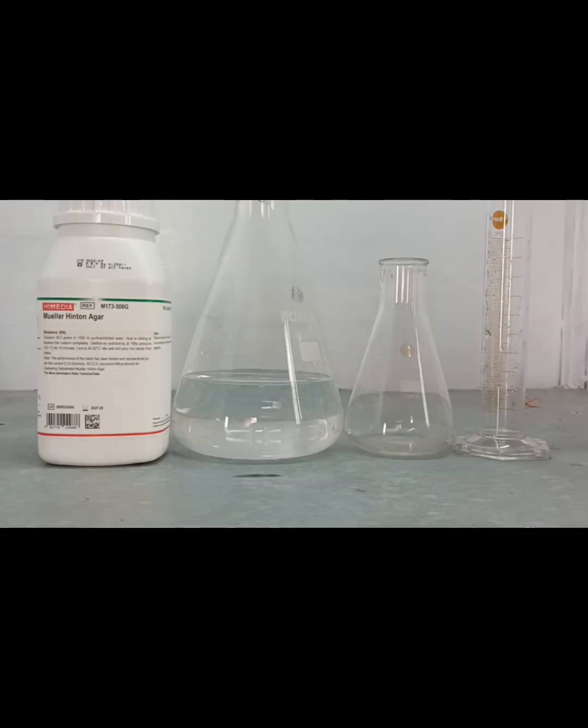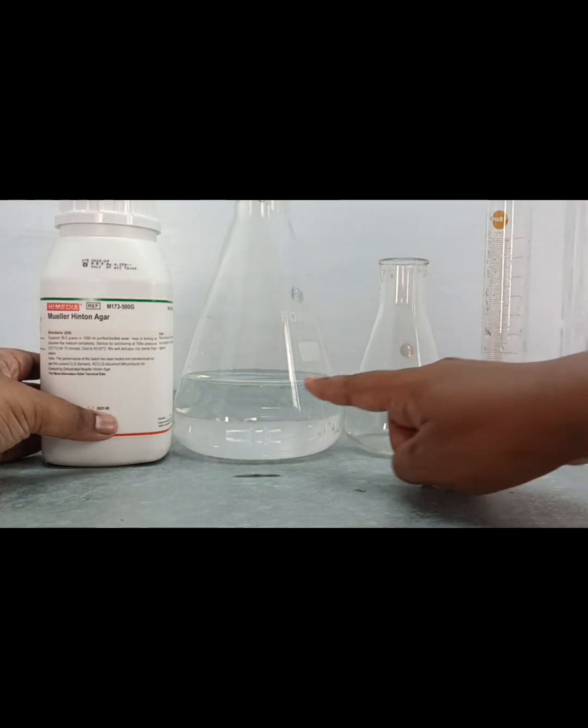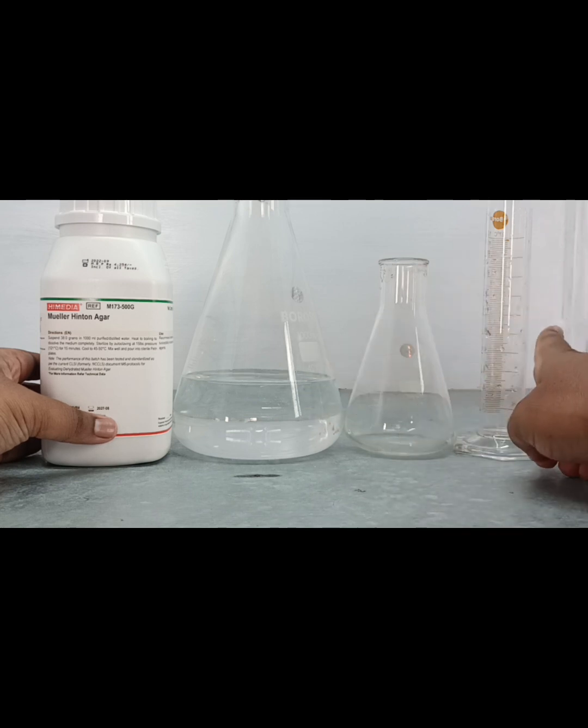For the preparation of Mueller Hinton agar, we need Mueller Hinton agar dust powder, sterile distilled water, a conical flask, and a measuring cylinder.